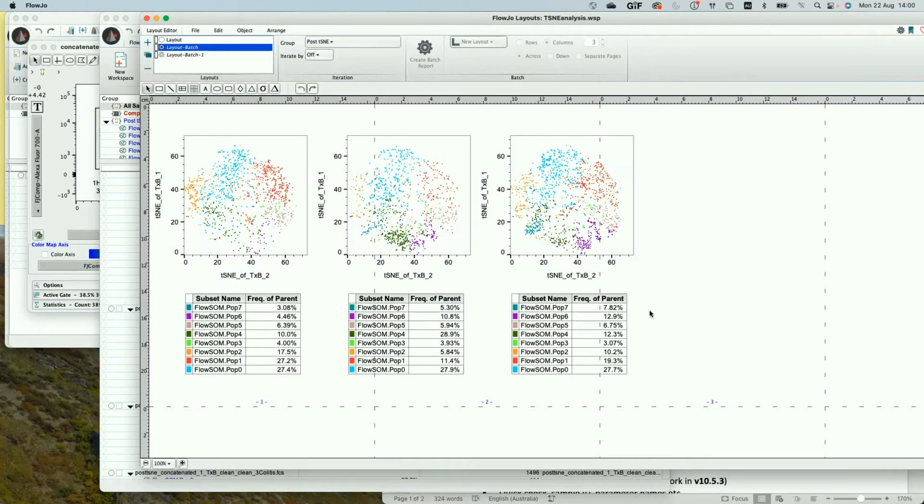And you really want to be looking at least a doubling at this stage, when everything's concatenated together, before you start going back to all of your original raw files, applying a new gating strategy and looking statistically. Because by the time you go back to each sample one by one and apply a new gating strategy and try to understand if there's a statistical difference, you really want to be starting with at least a doubling, a fold change of 2, before you're going to find anything.